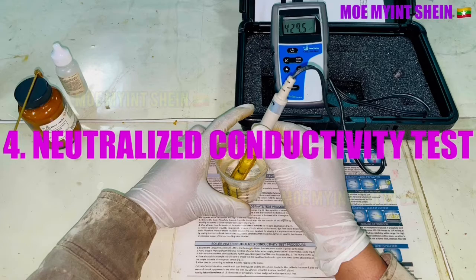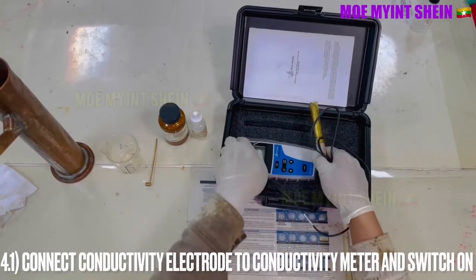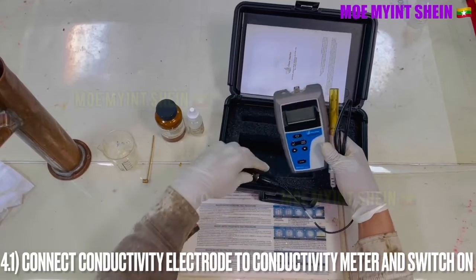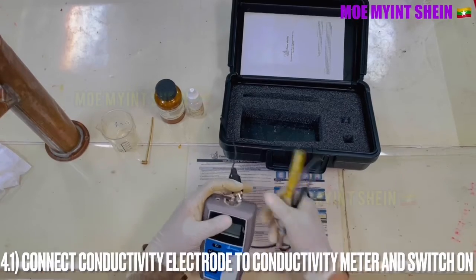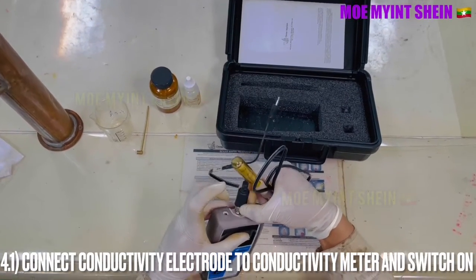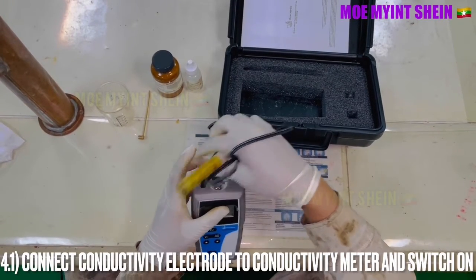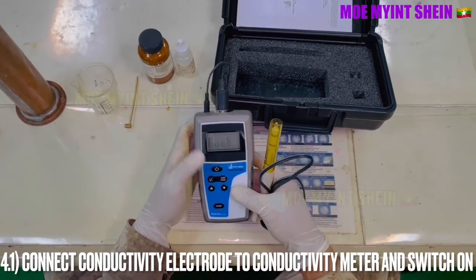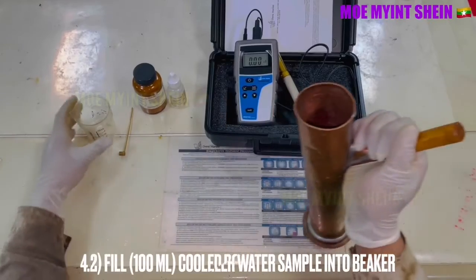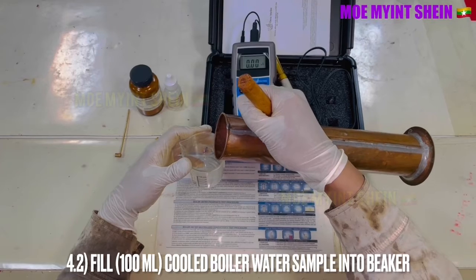We will carry out the neutralized conductivity test of boiler water. First, connect the conductivity electrode to the conductivity meter and switch on. Fill 100 milliliters of cooled boiler water into the beaker.